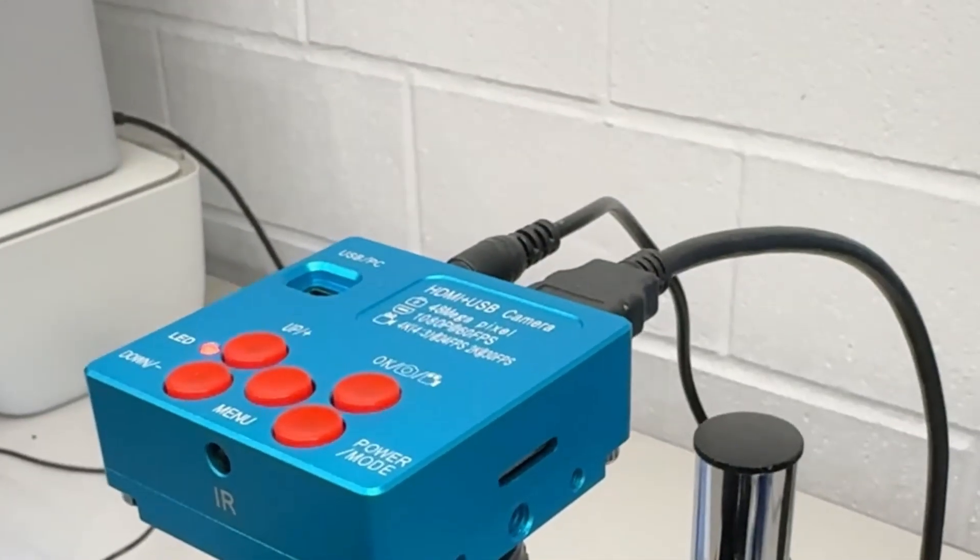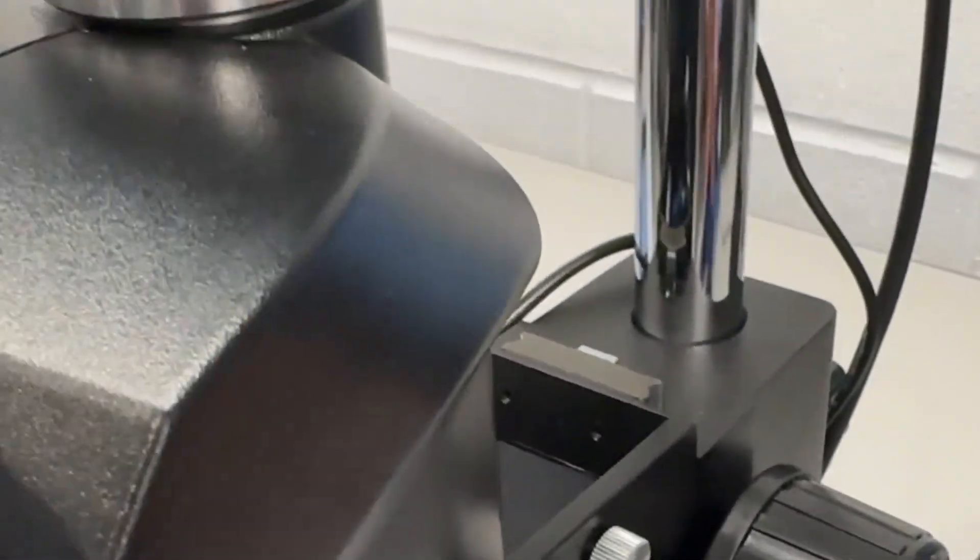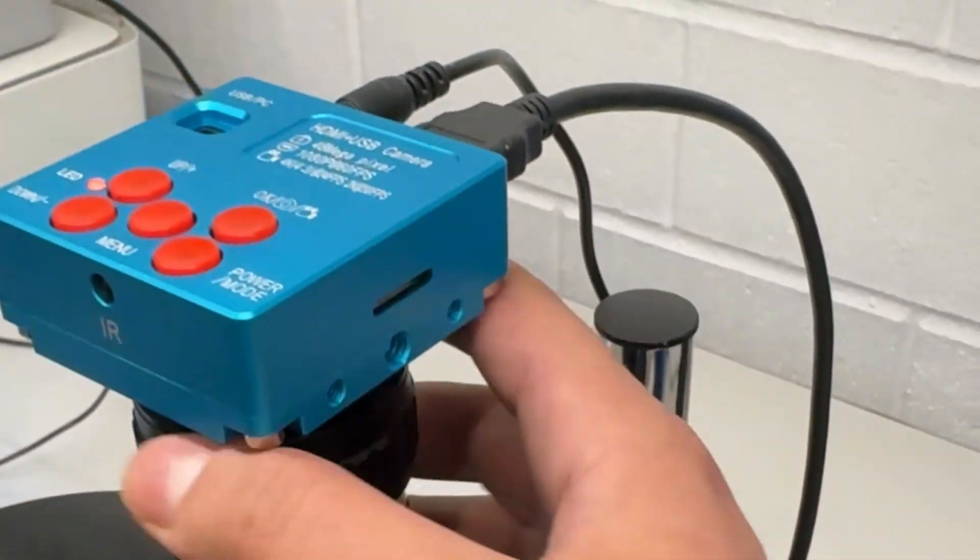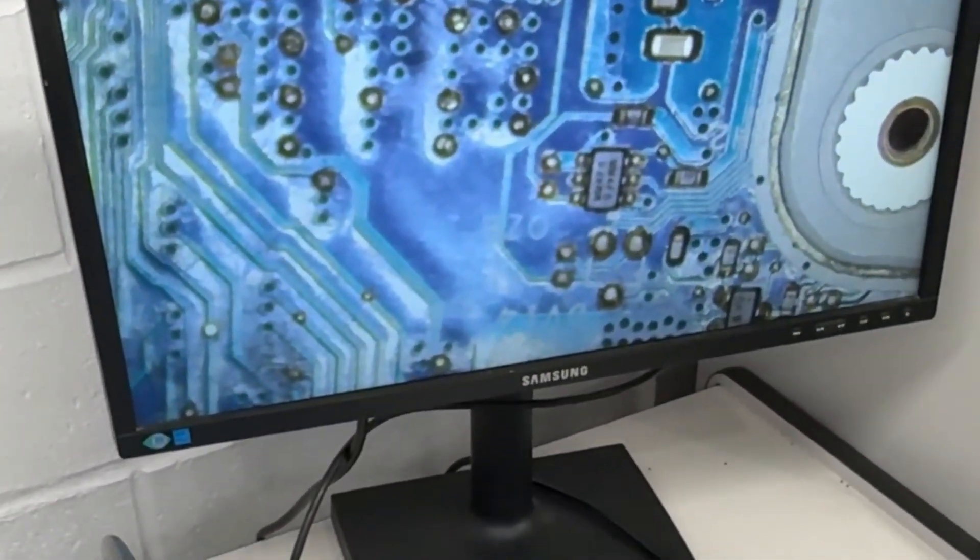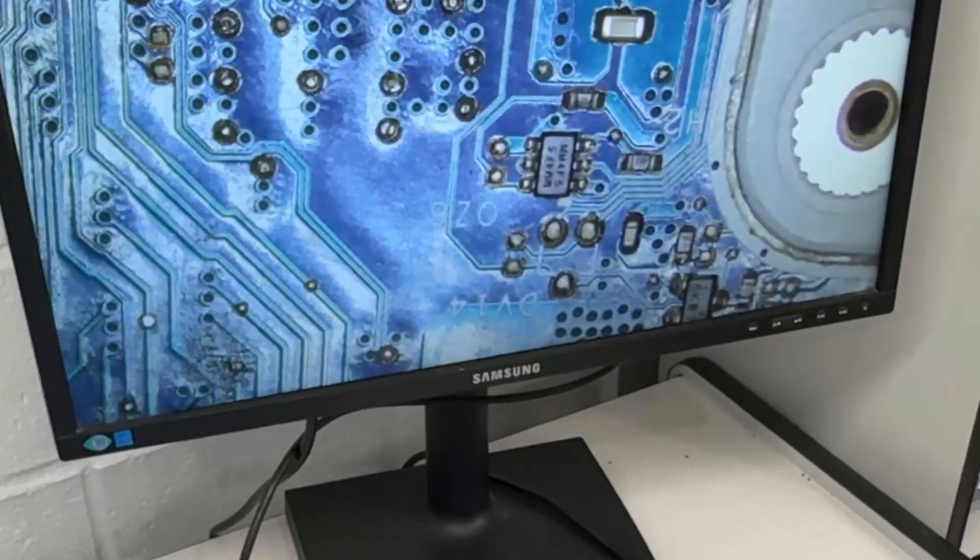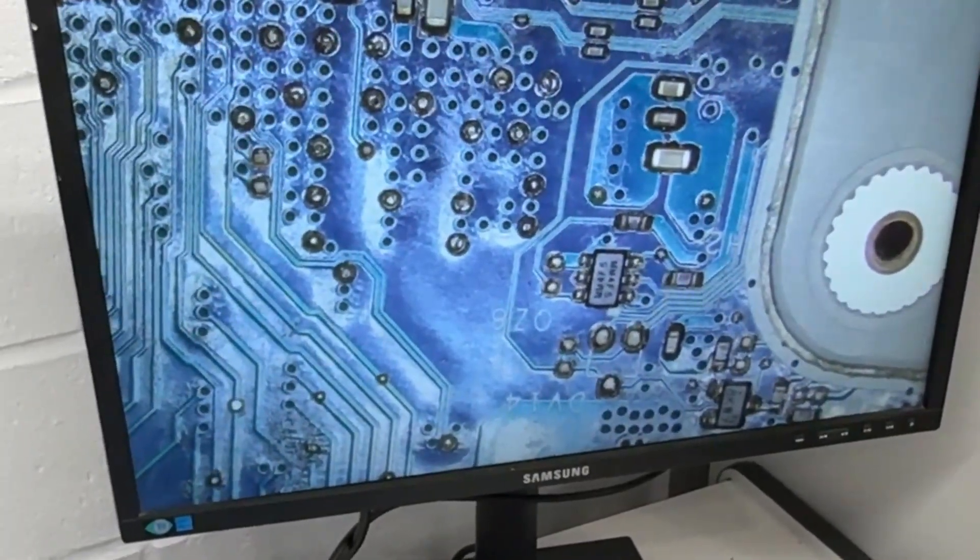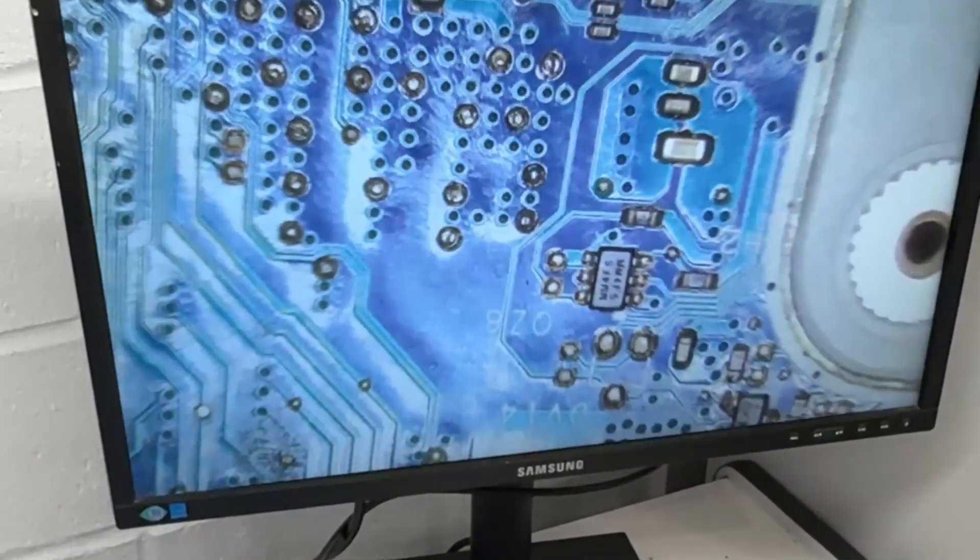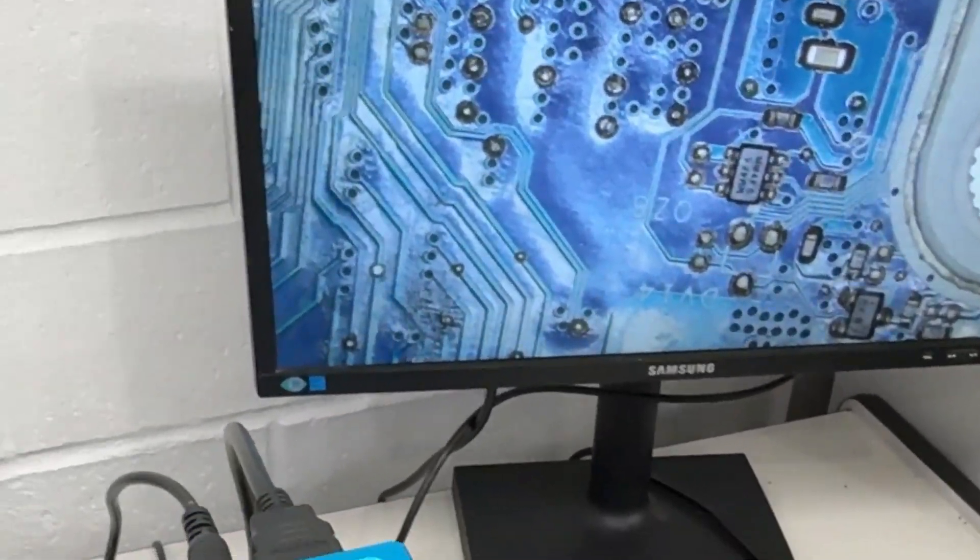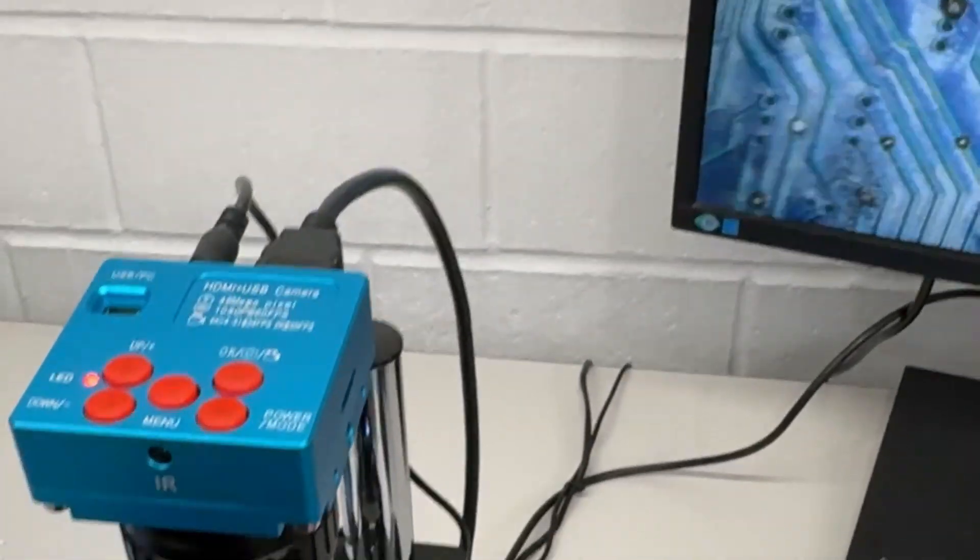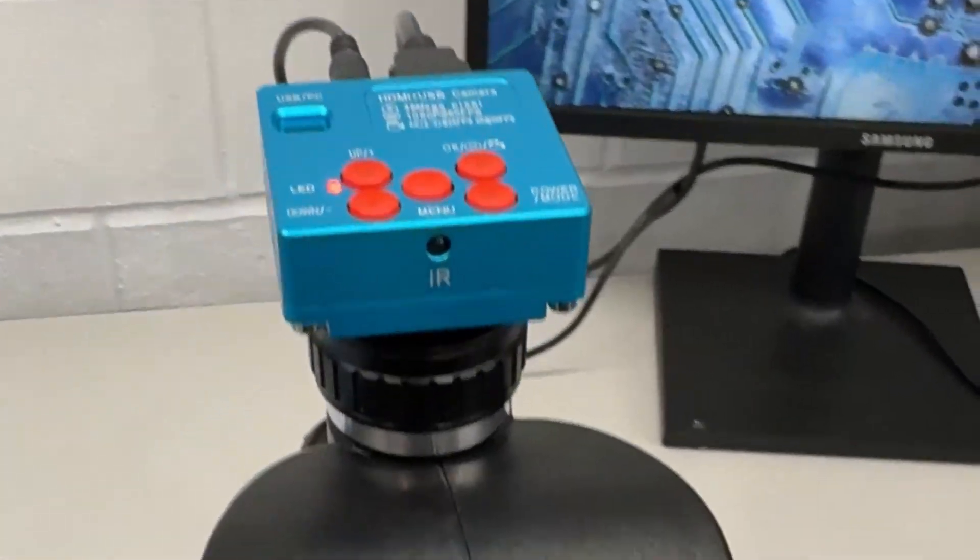The focus point is one for the camera and one for the main lens. So this is to go up and down, and the other one is to adjust the focus for the camera. As you can currently see, we're a bit out of focus, so if I twist it a little bit and there you go, this is the perfect focus right now. You can just literally zoom in and zoom out and you don't have to change the focus. Once you set all the focus points then you can just directly zoom in and zoom out and it works like a charm.